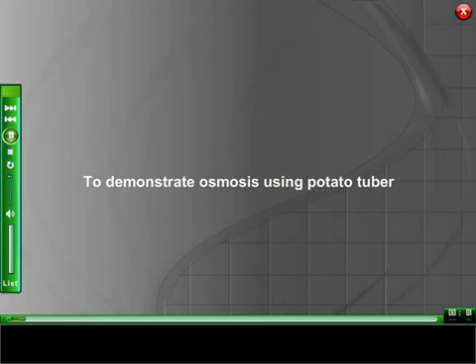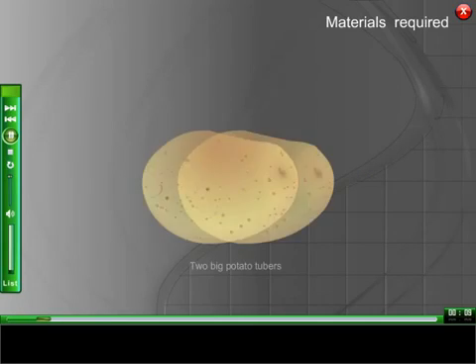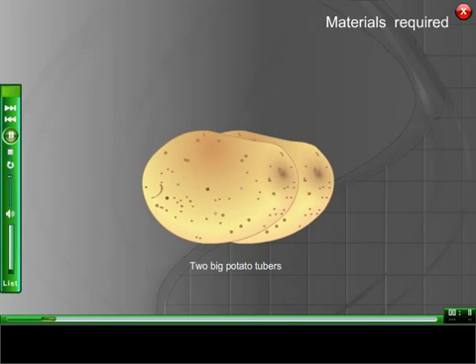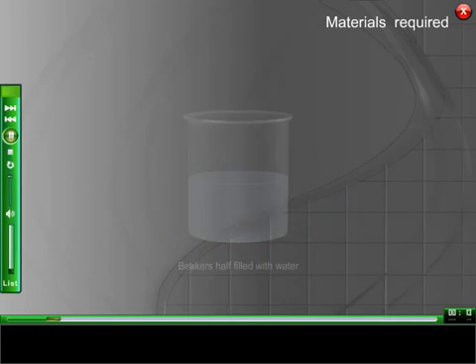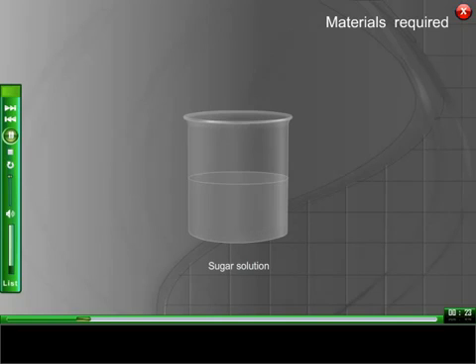To demonstrate osmosis using potato tuber, materials required: two big potato tubers, beakers half filled with water, pins, knife, sugar solution, water.